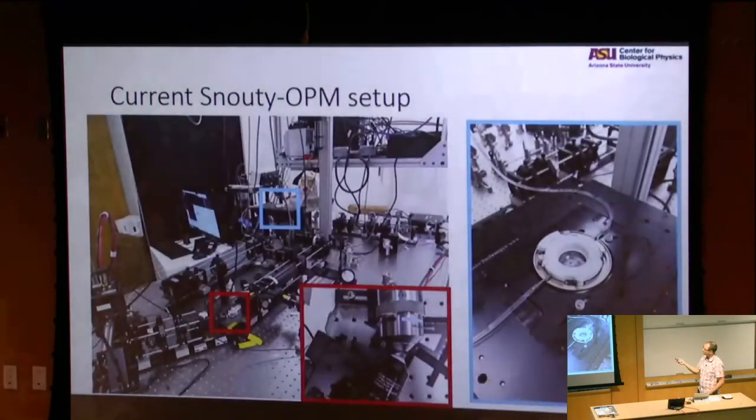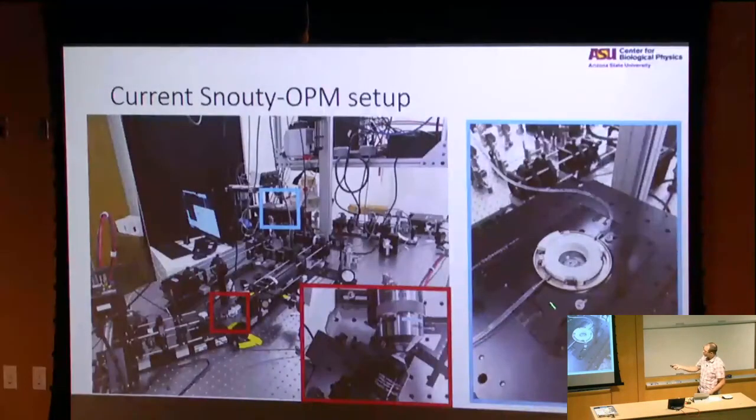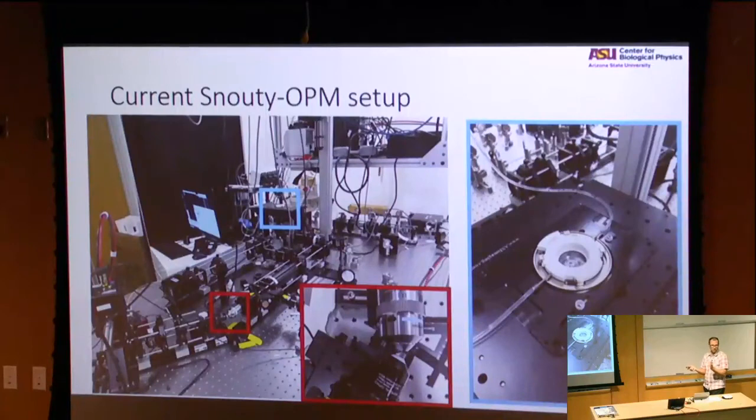So here's what the instrument looks like. We actually put a flow cell on top of it. This experiment is pretty much impossible with any existing high numerical aperture light sheet. So the lattice light sheet can't do this. The inverted lattice light sheet that Zeiss is now selling, where they cancel the aberrations with a freeform optic, should be capable, but no one has actually done it yet.